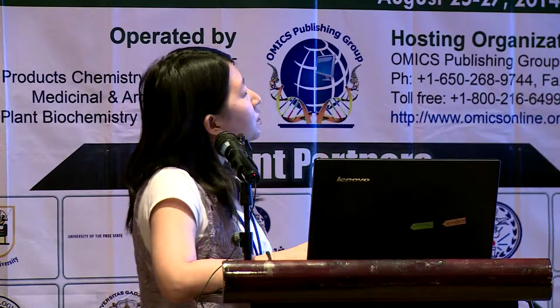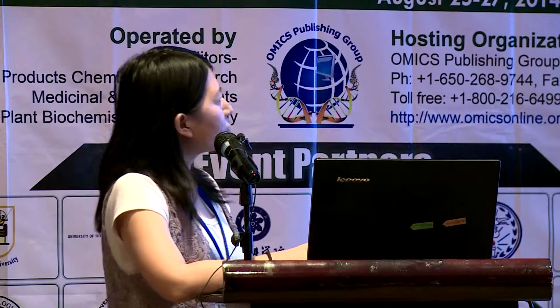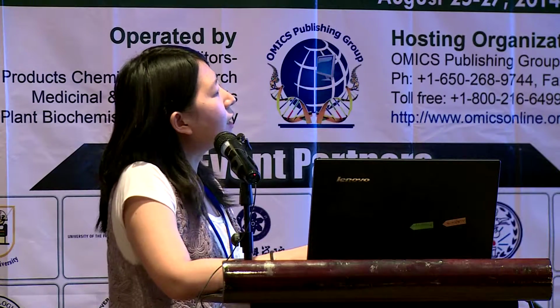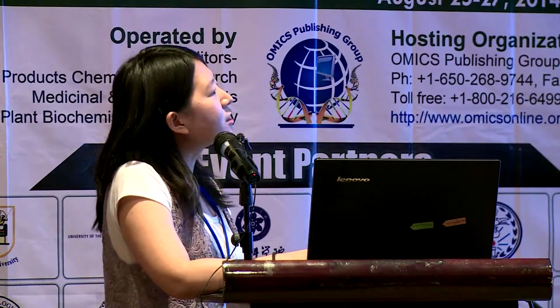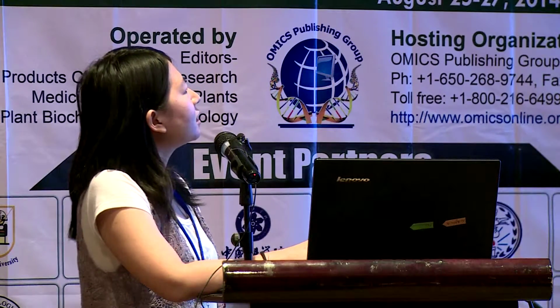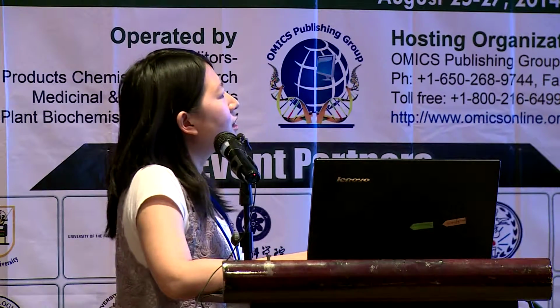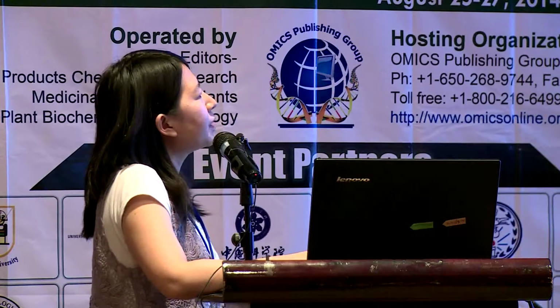And from this graph, we can see that Lycoris longitubea and Lycoris sprengeri have the highest level of lycorine-type alkaloids. It's near 1.5 microgram.